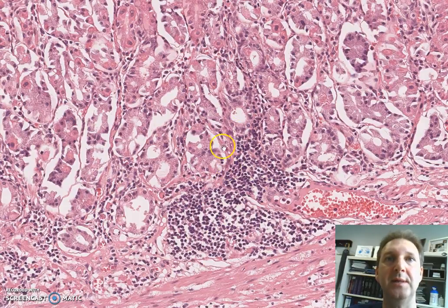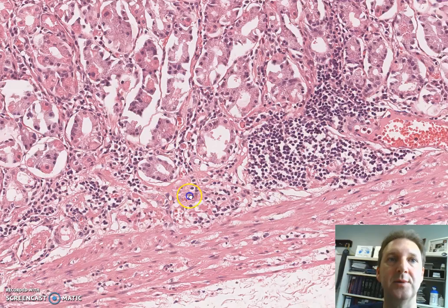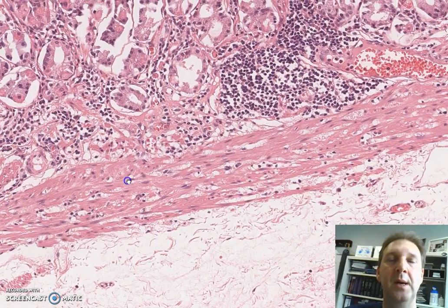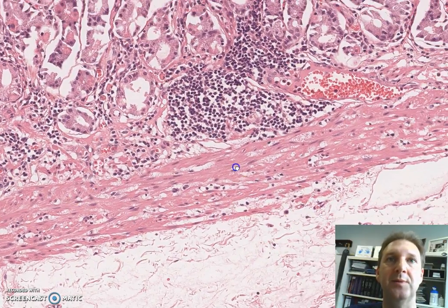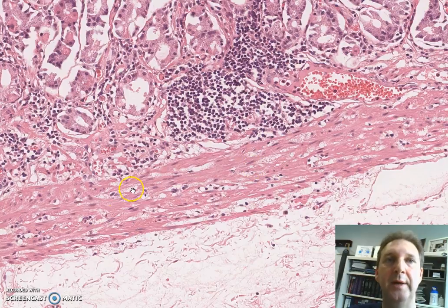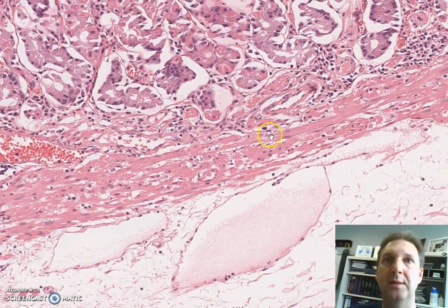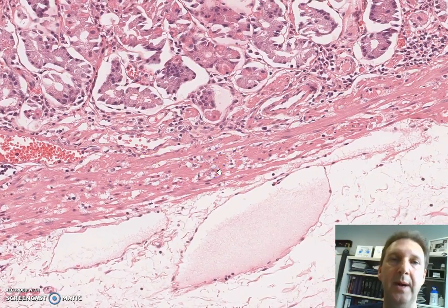Occasionally you can see some lymphoid aggregates. Those are not common, but you can see them. And as we mentioned, there is the muscularis mucosae, which is this continuous band of smooth muscle bundles.